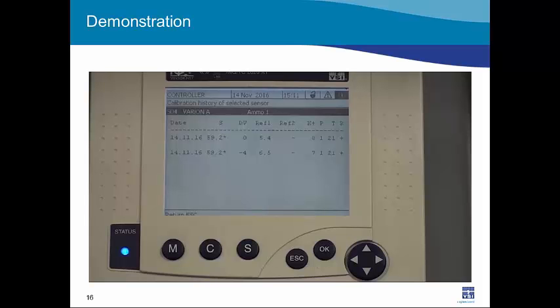Under that, then, each subsequent matrix adjustment will be listed. In this case, I only have one, but it shows the drift voltage. So this, based on when the electrode was zeroed, the drift voltage calculates how far off from the expected millivolt signal you are.